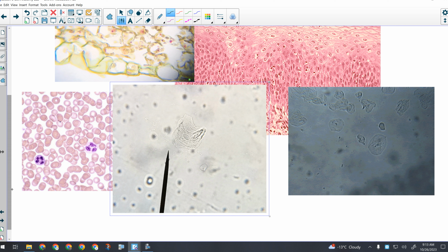Okay, when that's done, that goes in the garbage. The cover slip goes in the garbage. Wash and dry with soap the slide, because it has, after all, had your mouth on it. So make sure you wash and dry. Okay, wash with soap and dry before returning it to the front. Okay, everybody with me there?